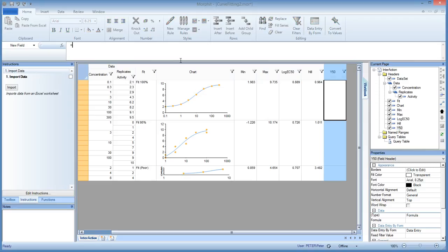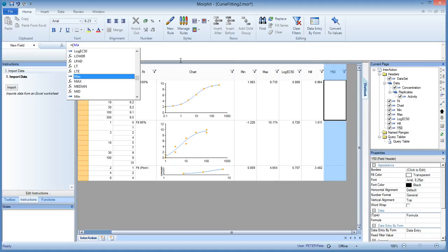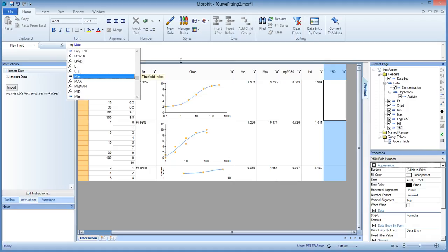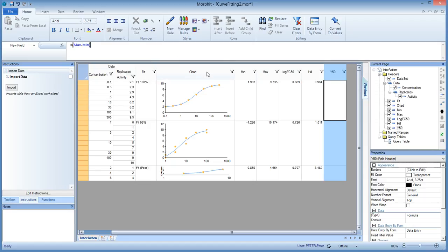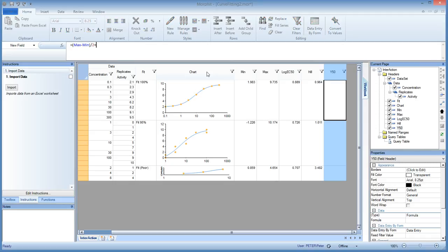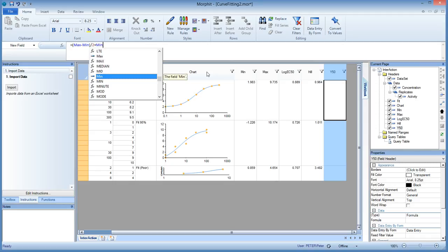So the formula is max, min, so we are pointing to these two, the min and the max. We divide that by 2 and we add the minimum. And that gives us the value of around 6 as we were predicting 5.8 right in the middle between the minimum and the maximum.